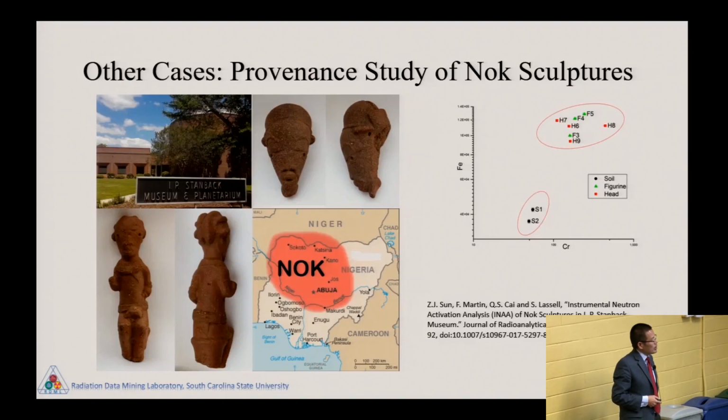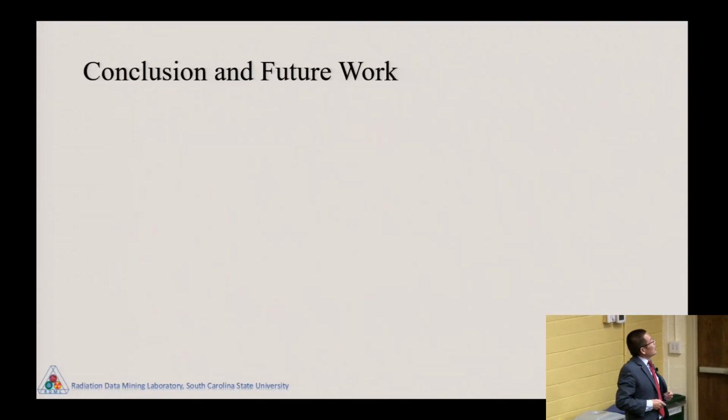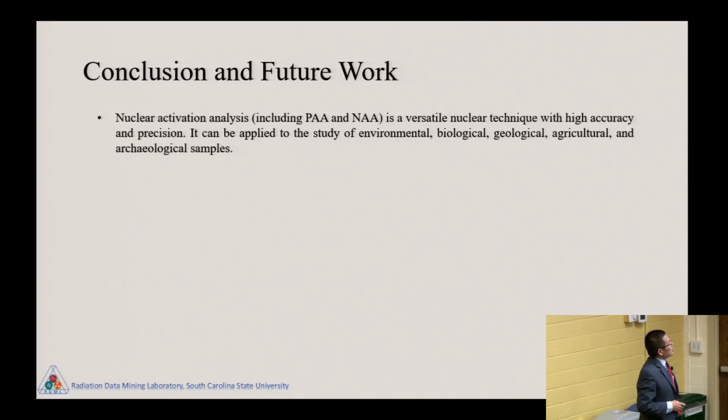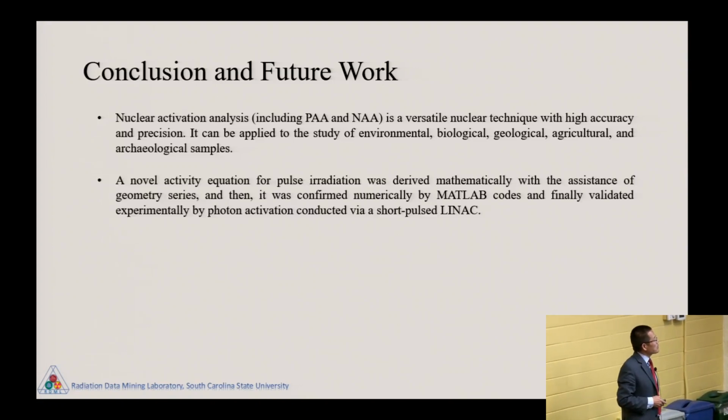And this article was already published in the Journal of Radioanalytical Chemistry. Okay, conclusions. NAA and PAA is a versatile nuclear technique with high accuracy and precision. It can be applied to the study of environmental, biological, geological, agricultural, and archaeological samples.